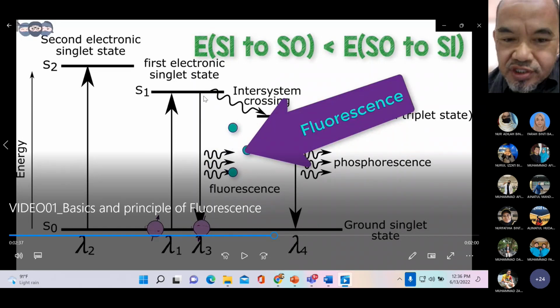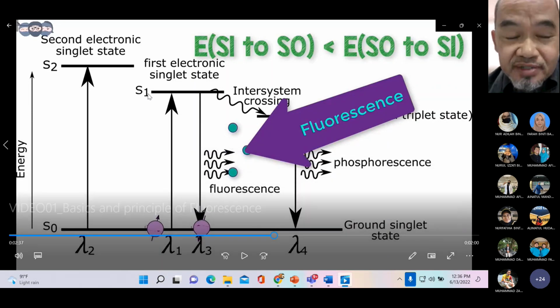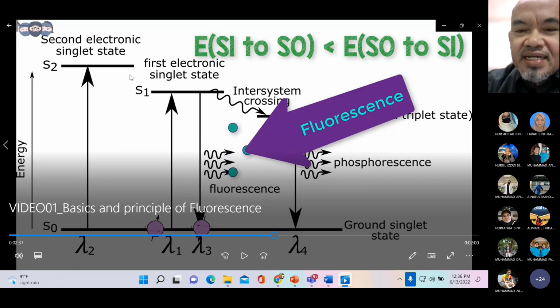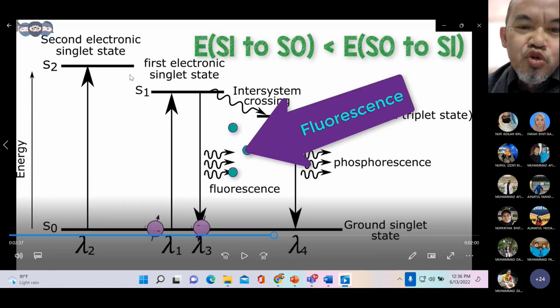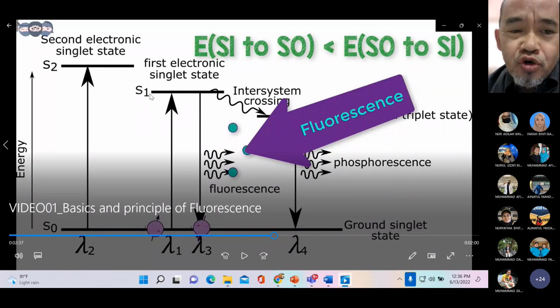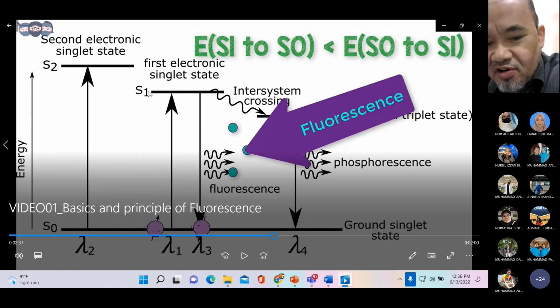Tapi kadang-kadang sebelum tukar jadi fluorescence ni, contoh yang inilah, kalau S2 ni, sebelum dia turun ke ground state, dia mungkin akan turun ke S1 dulu, dengan dia membazirkan tenaga dia. Tenaga tu dia pakai sebagai relaxation. Dia akan relax, turun daripada S2 kepada S1 dan tenaga tu akan dibazirkan. Maknanya akan ada tenaga dihilang. Kalau tenaga dia adalah 10 contohnya, tadi kita kata daripada 100 hilang 10 jadi 90. 90 kalau dia ditukar dari fluorescence terus, dia akan appear still pada panjang gelombang yang tinggi.